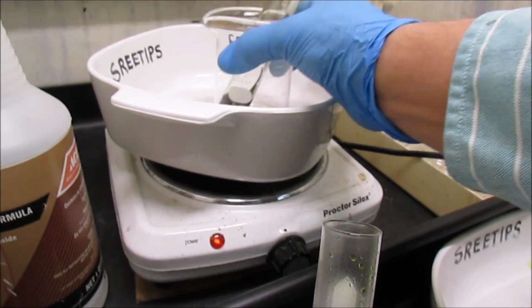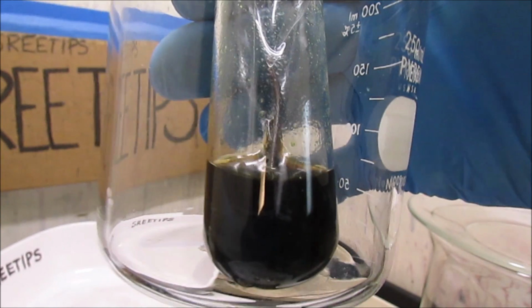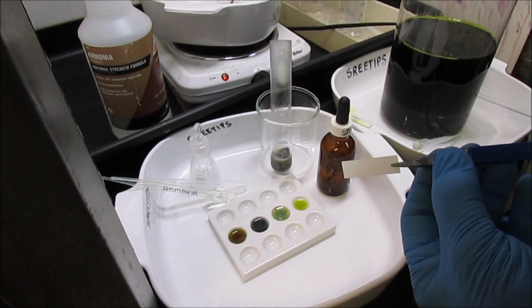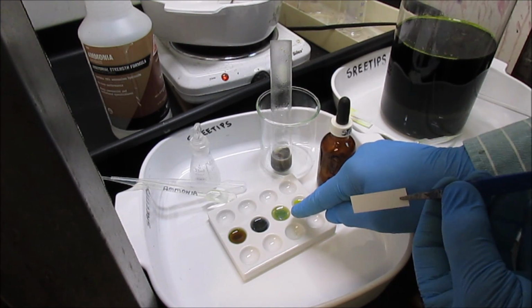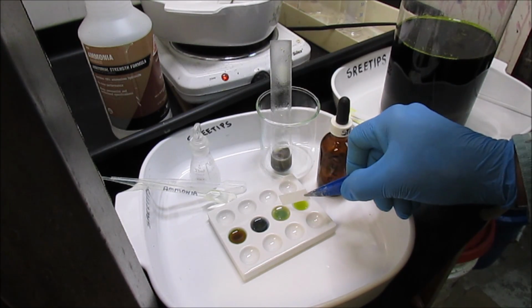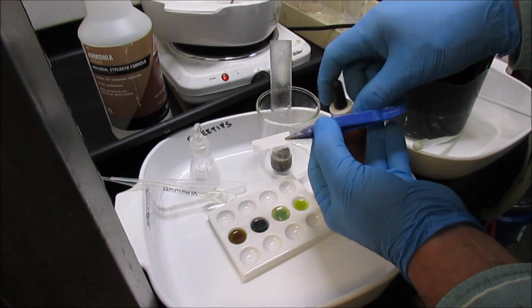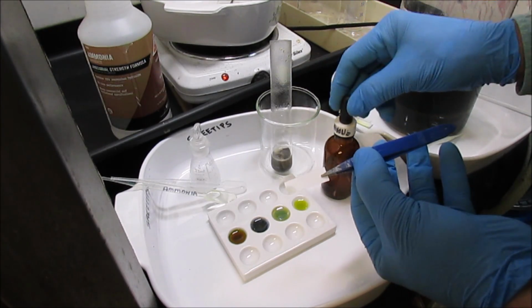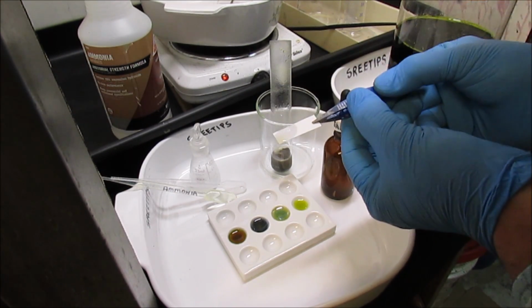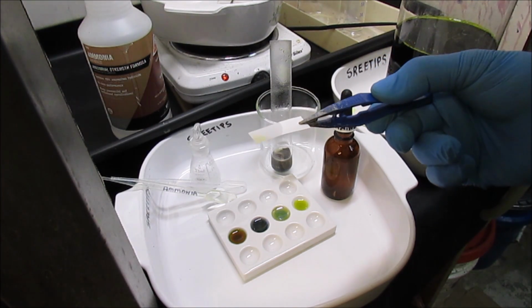Up here, I've got some of the solution in with a few pieces of copper. In this third cavity, I put some DMG and I got some precipitate that fell to the bottom of the cavity. I'm going to get a little bit of the solution that's left around it on this piece of filter paper here. And I'm going to test that with some stannous. And I can see a faint orange stain there.